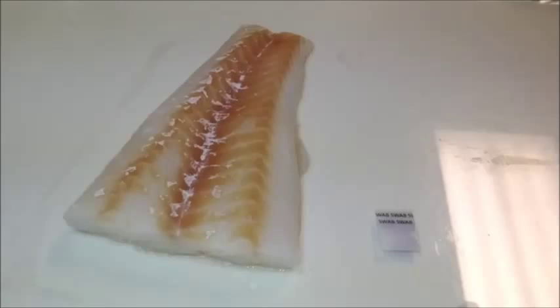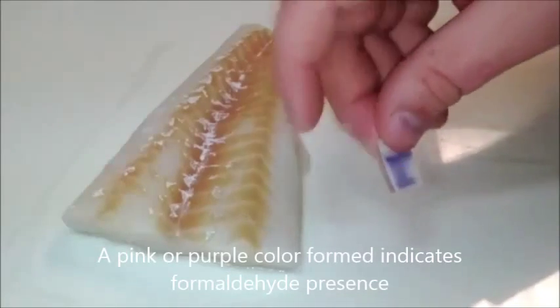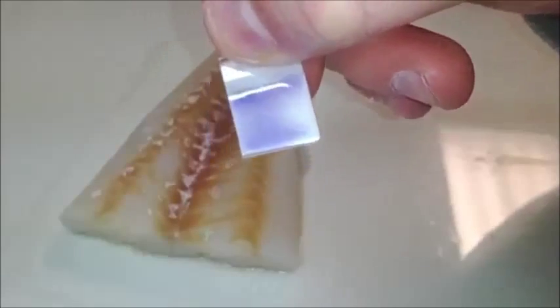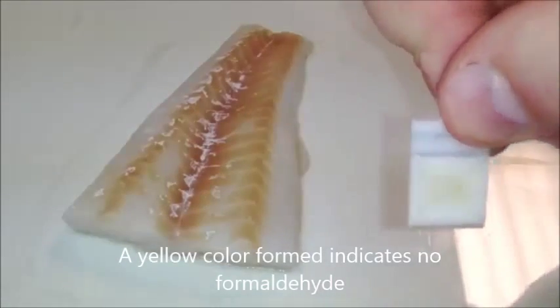After the time has passed, turn the detector over and view the color. If a pink or purple color forms, it indicates the presence of formaldehyde. If only a yellow color forms, it indicates that there is no formaldehyde present in the sample.